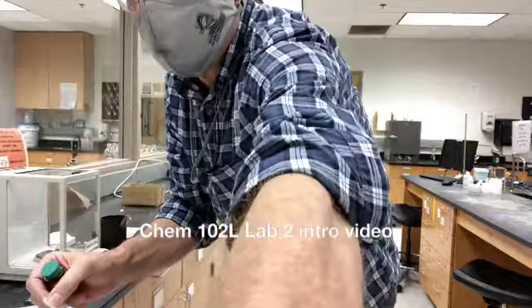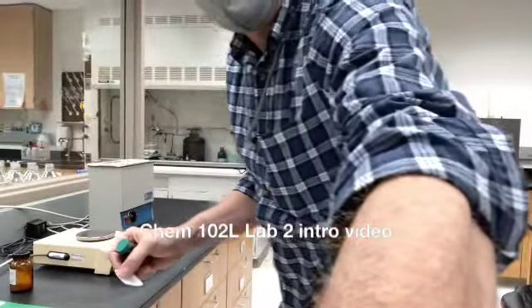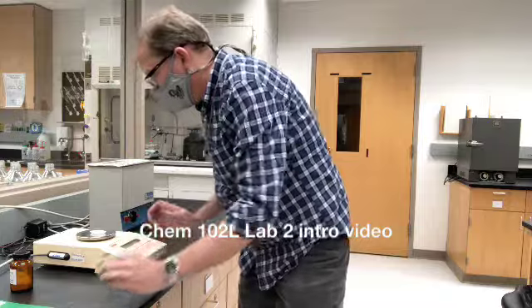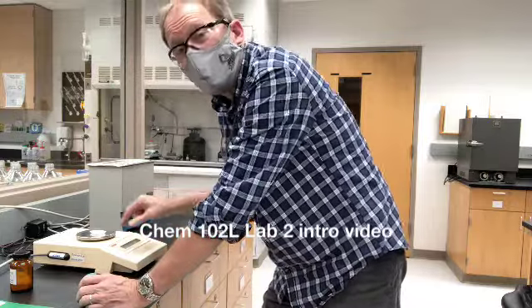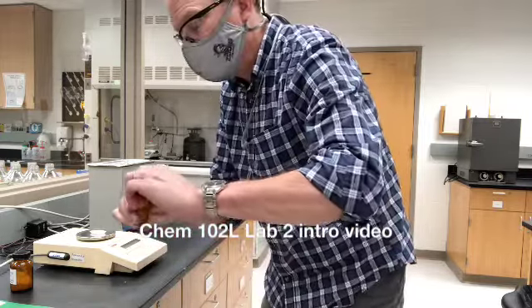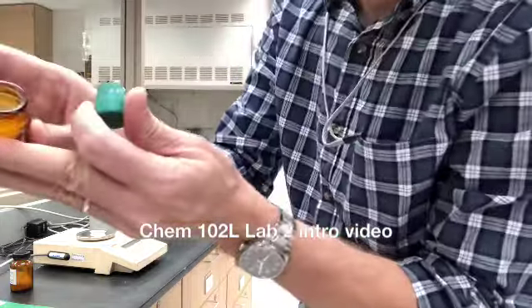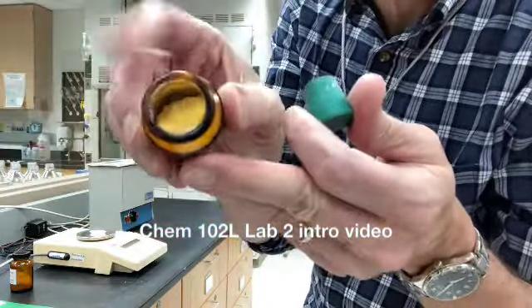So once again, I'm going to take you down the aisle here. And what we want to do is put this boat on here. And now, of course, I get a negative value because this weighs less than what we weighed before. So I'm going to hit tare. It says 0.00. And now I want to take some of this powder. And this one doesn't look like it's as chunky as the other one.